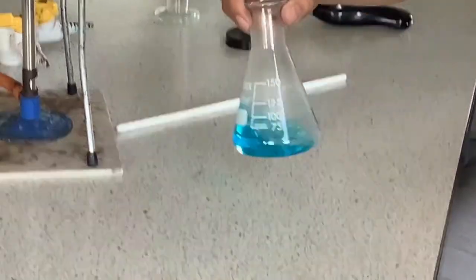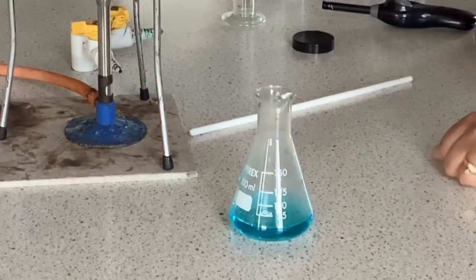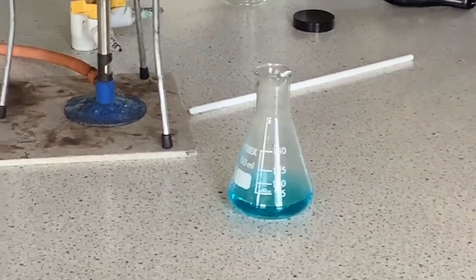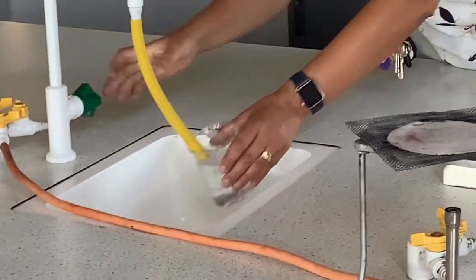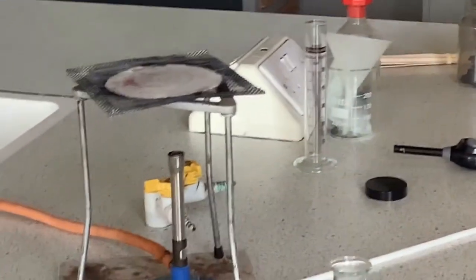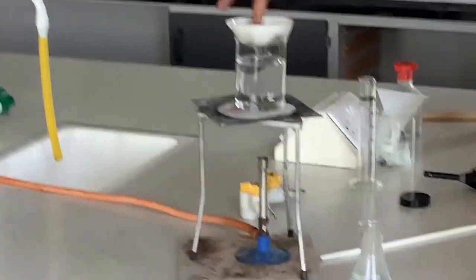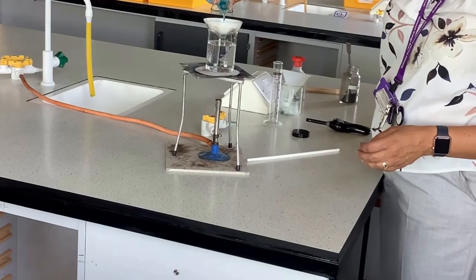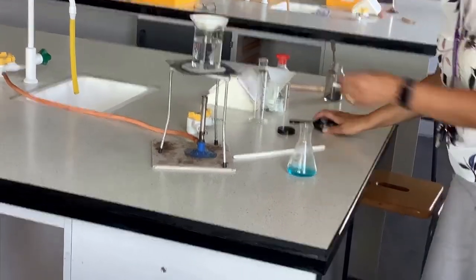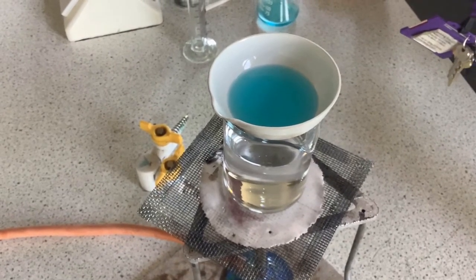So we said at the beginning we were making a soluble salt. So I now have copper sulfate dissolved in water, and I need to remove that water. The way that we're going to do that is by using a water bath and an evaporating basin. So here I just have water that will gently heat this evaporating basin. I'm going to put in some of the copper sulfate solution and then light my Bunsen burner again. We always heat on a blue flame, so I'm going to change it to a roaring flame.